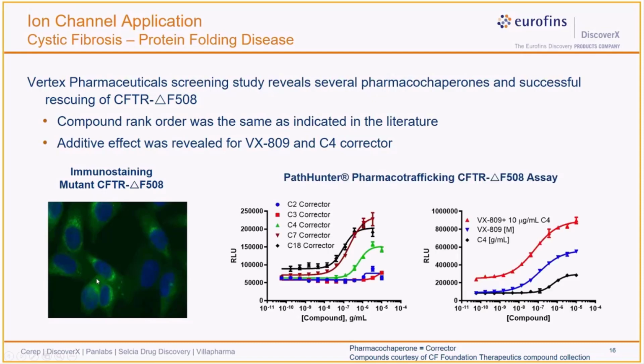And then next, we wanted to introduce pharmacochaperones to rescue this mutant ion channel. There are a number of correctors, or pharmacochaperones, as they term it, that were used in this example to promote the trafficking of the CFTR receptor. But I'm only showing you a few here.